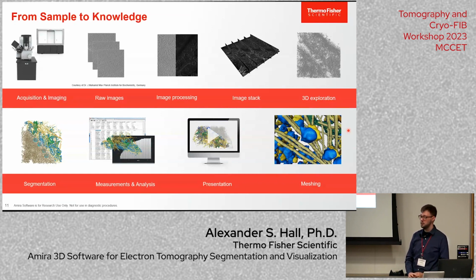If you have the right software access, you could do it from home if you wanted to. It's taking your raw image data. In the case of Cryo-ET, that would be your tomograms. So they've already been aligned and reconstructed in IMOD or some other software. And through image processing and segmentation, you're going to pull out regions of interest for presentation.